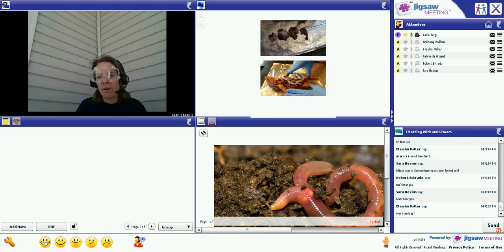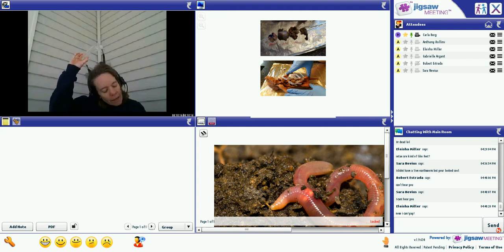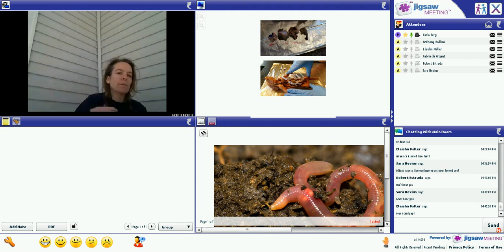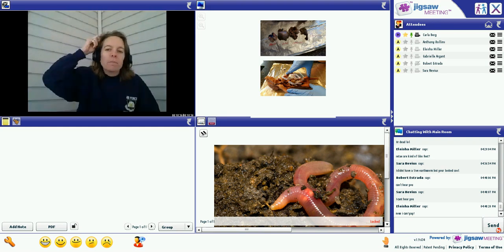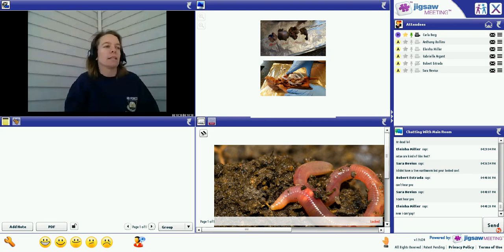All right, go ahead and take your gloves off because now we are going to do some labeling. So you can take your gloves off, and if you're careful, you can take your safety glasses off. And we're done dissecting per se. Now we are going to go exploring in our worm. For me, it's easier without the glasses on.